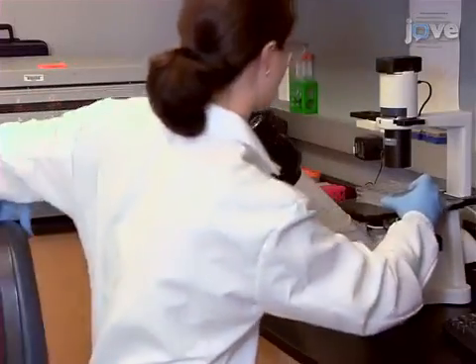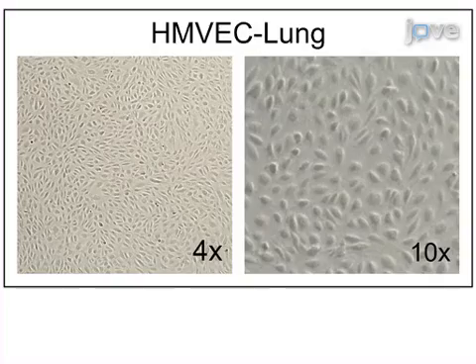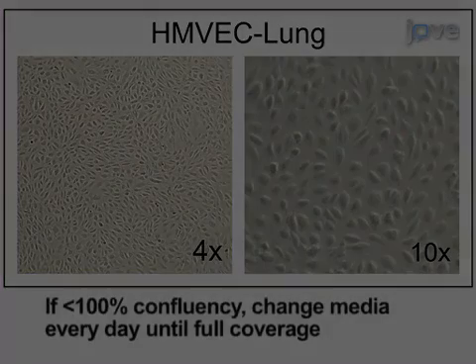On the day of the assay, use phase contrast microscopy to confirm that the cells exhibit a healthy cobblestone appearance with little cell debris.